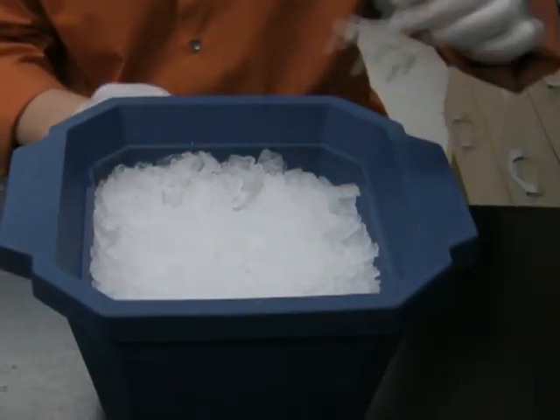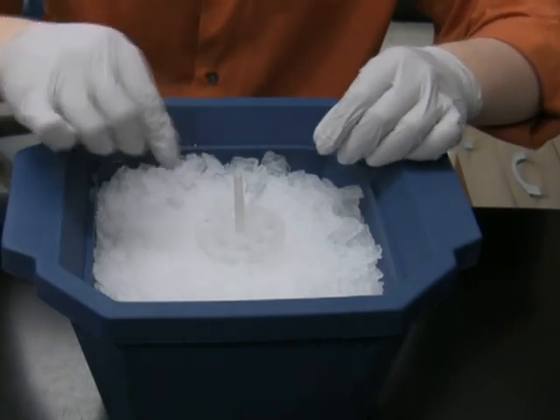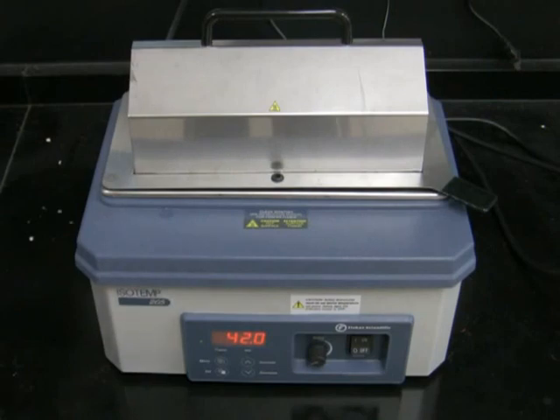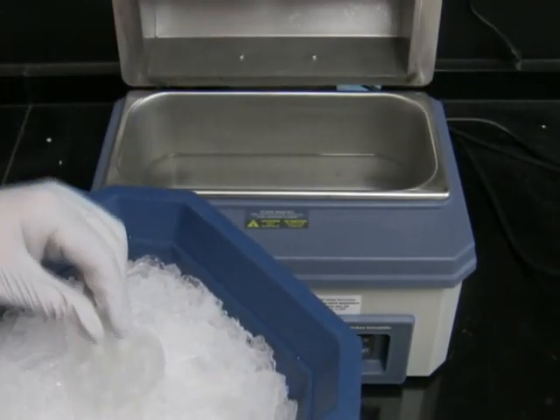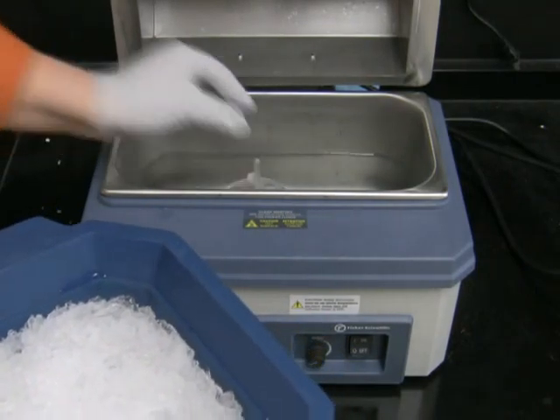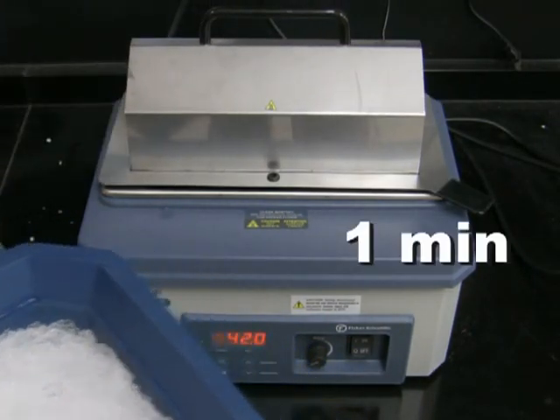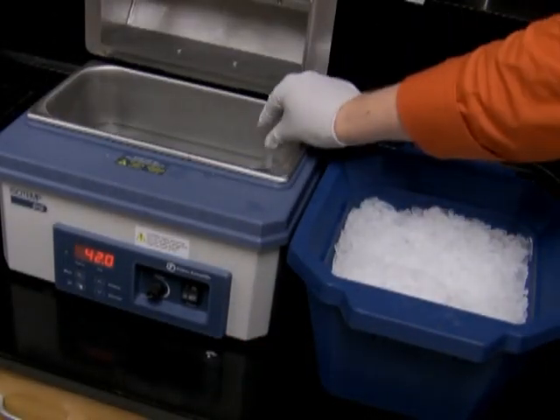For the heat shock, I transfer the tubes into a floating rack and put them into a 42 degree water bath for one minute. After the heat shock, the cells go back on ice for another 5 minutes.